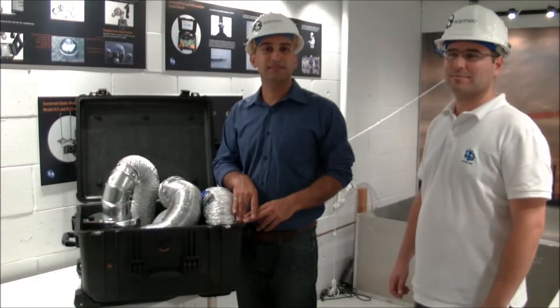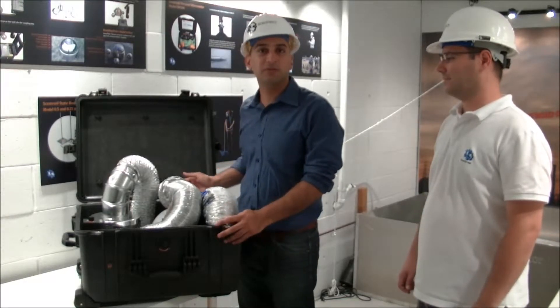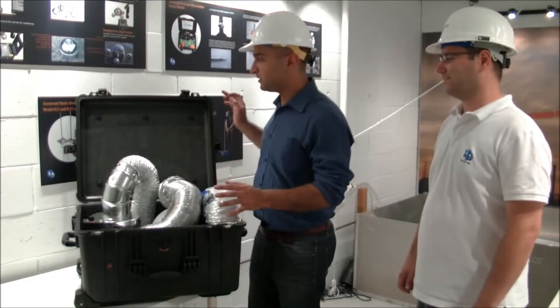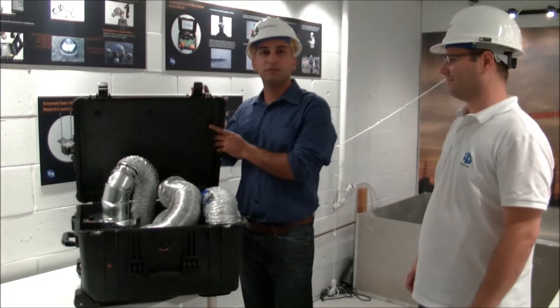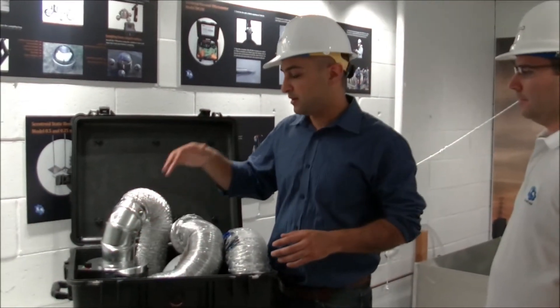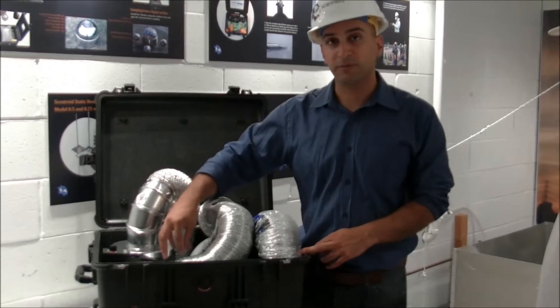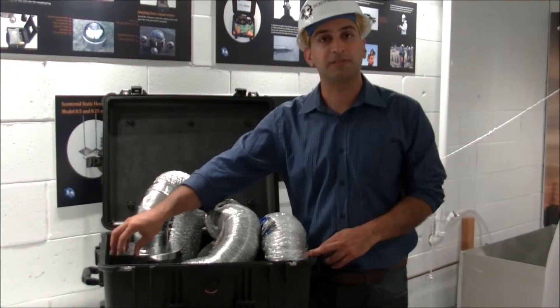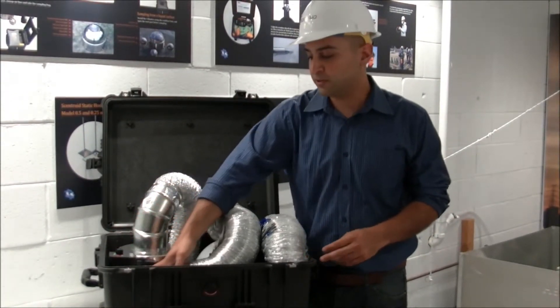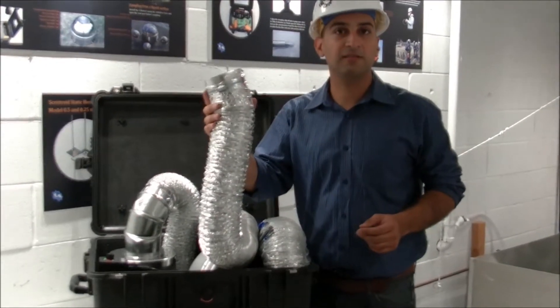The SW60 is a complete solution and comes with its own air supply. The air supply is enclosed in a waterproof and shockproof hard case. It includes an active carbon filter, a compressor or blower, a rechargeable battery, and a variable speed controller. To deploy it's very simple — just open the box and connect the duct to the wind tunnel.